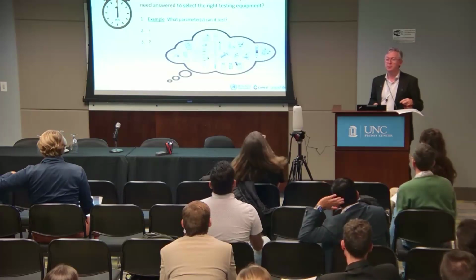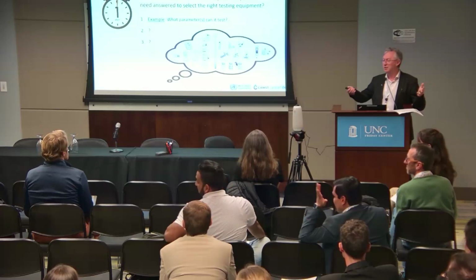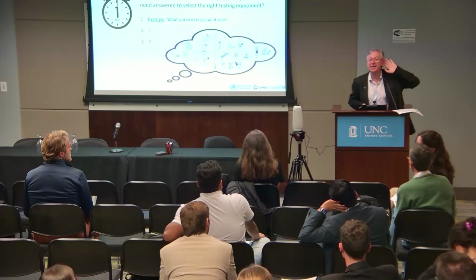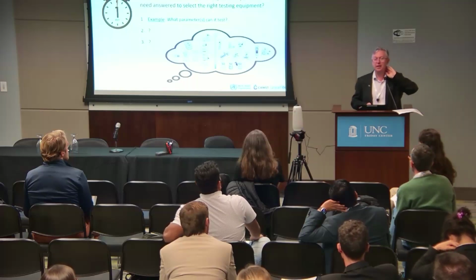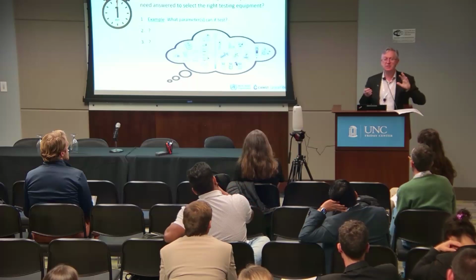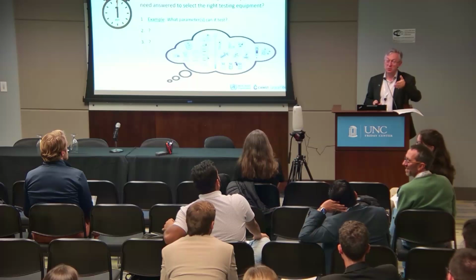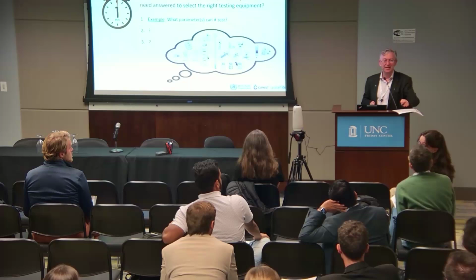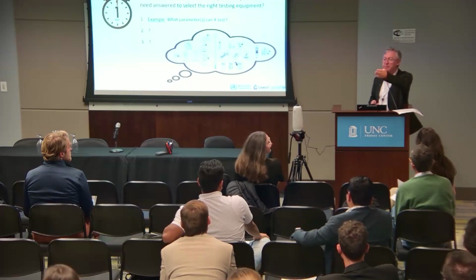Great, thank you. Whose job it is to test? What are their incentives? Cost to test. Cost, thank you. Yes. Inputs to test needs. Sorry? Inputs, energy, what does the test need to operate? Excellent. Energy, what kind of resources and setup do you need around you to run this? User-friendliness. Rick? From the last session, what's going to be done with the data? What purpose are you doing your monitoring for?